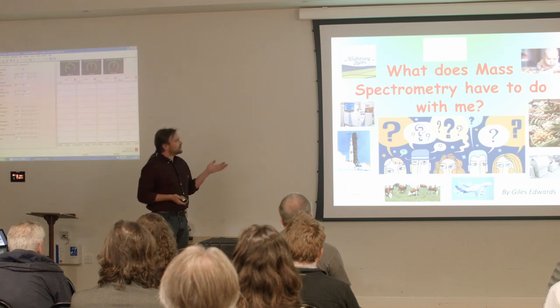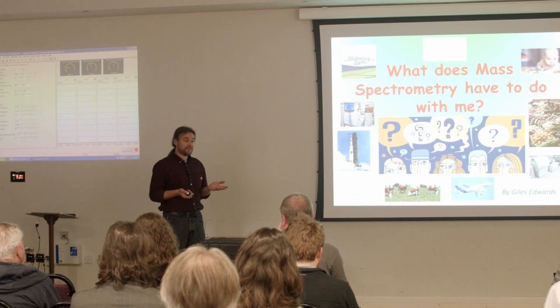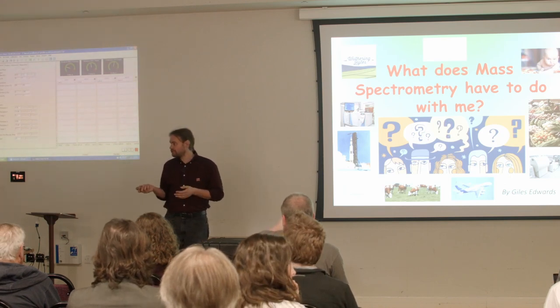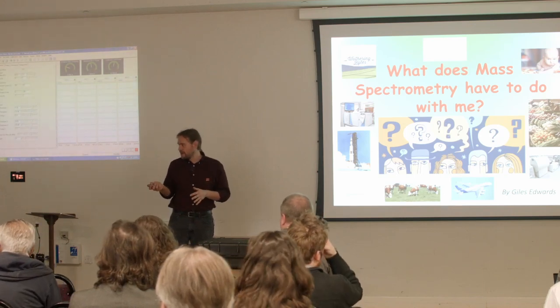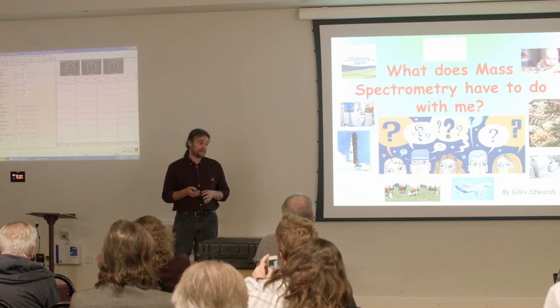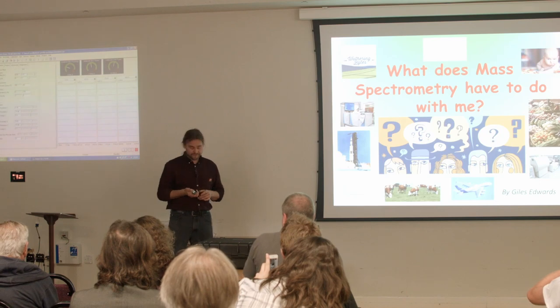So the talk today is basically, what does mass spectrometry have to do with you guys? Because you probably haven't seen a mass spectrometer. Well, you probably have seen them, but you might not have noticed them. There's a lot of mass spectrometry that goes on behind the scenes, so they do have a big part to play in your daily lives.